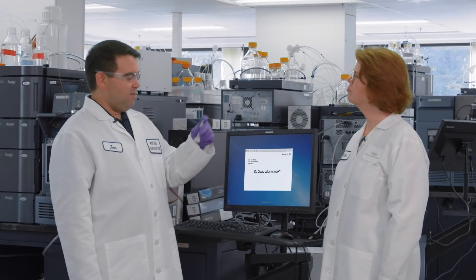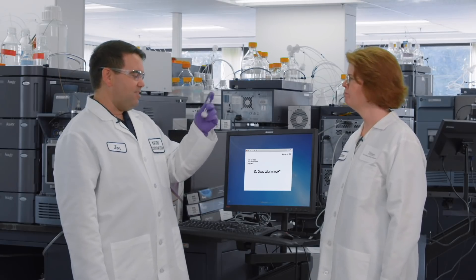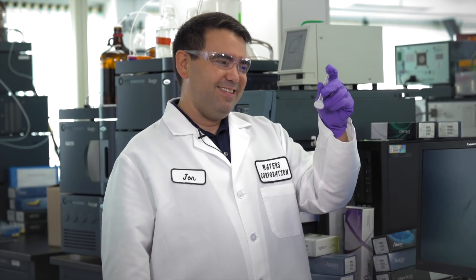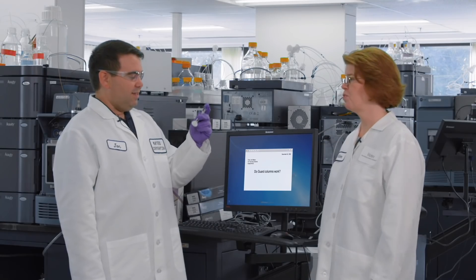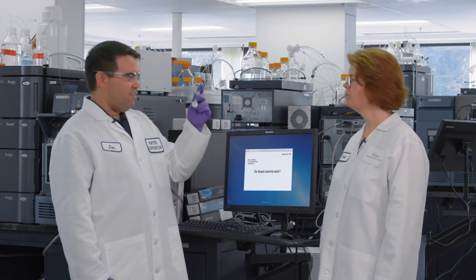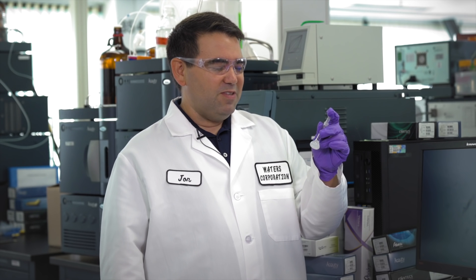I already know the perfect dirty sample to use for this experiment. For a dirty sample, I once again took that Daniprazil tablet, and as recommended by the United States Pharmacopoeia, I just dissolved it in a simple diluent — and you can see this is pretty cruddy stuff. Perfect sample for this experiment. So if we do a few big injections of this onto those two columns — one with the guard, one without — and monitor the pressure, you can see really how long it takes for those columns to kind of fail.